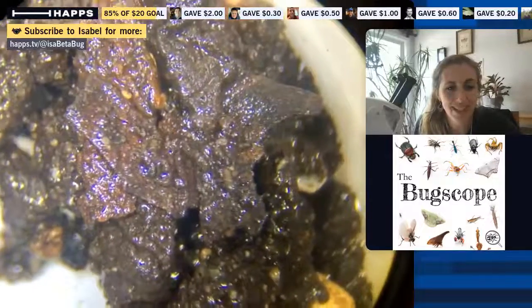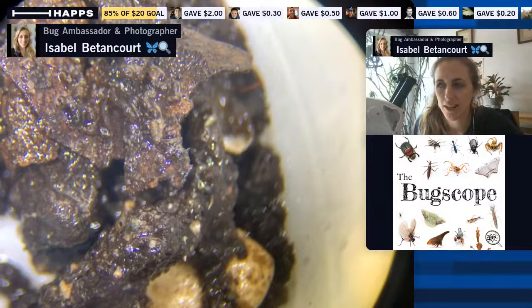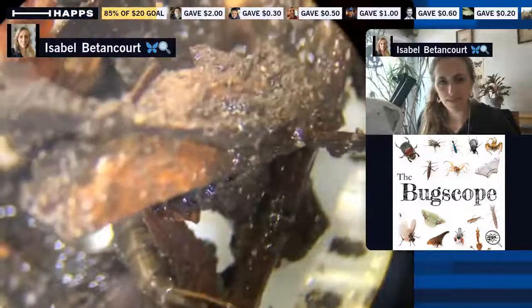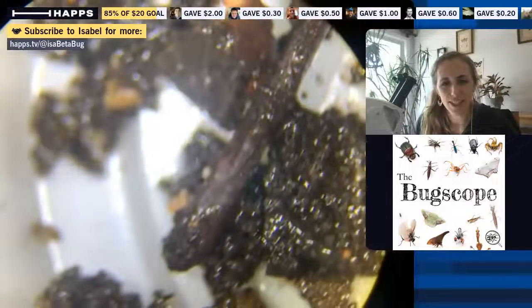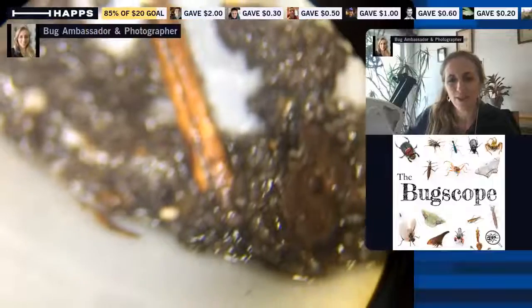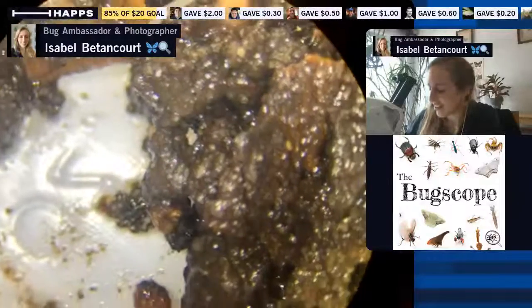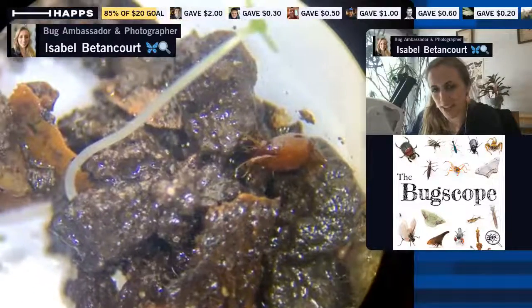David says it actually looks a bit like some of the water beetles — like the predacious diving beetle. It's been a while since I've thought about those groups, but yeah, it does look like some of the aquatic predatory beetles. So yeah, this is a beetle everybody — and beetles' larval forms are especially unknown in the general public. Ladybugs, for example, also have a larval grub form; they're mobile because they are predacious. It's so easy to forget, but they do.